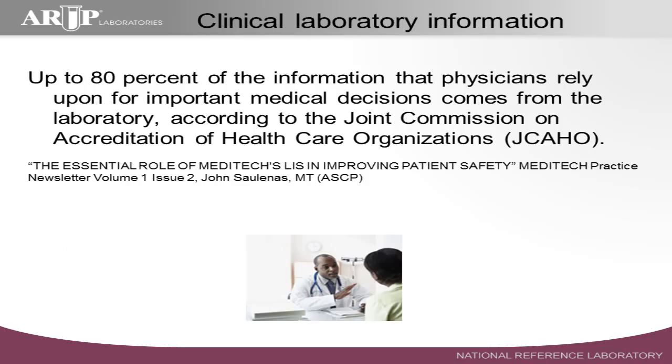Okay. So, for starters, I always think this is an interesting quote or statement to put up here, that the importance of the laboratory role in healthcare. So, on the diagnosis and treatment side, when clinicians are polled and asked, what's the most common type of information you use out of the medical record, which of course now is the electronic medical record, this individual was saying 80%, because it came from a JCAHO study or survey or something.